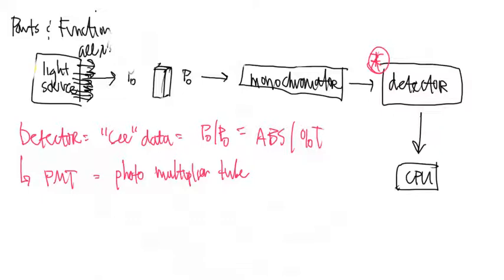Okay, so the way that this thing works is that light source comes into the PMT tube. Now, this is the detector, and I'm just going to draw a big box here. And then on this box, there's going to be kind of like a screen, and I'm going to draw little balls on them. All right. So what happens for the detector is that the light source comes in, and the light source hits the basically plate that has electrons on them. Okay, so these are all electron driven. And it knocks a few of the electrons off.